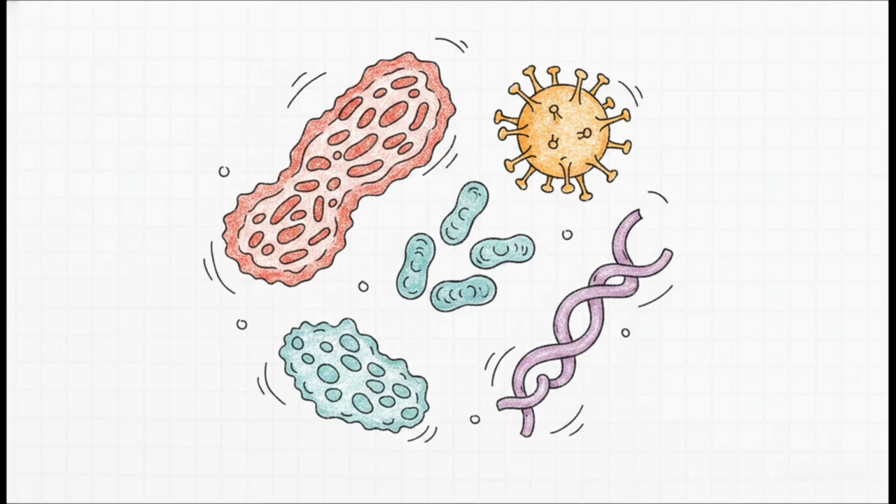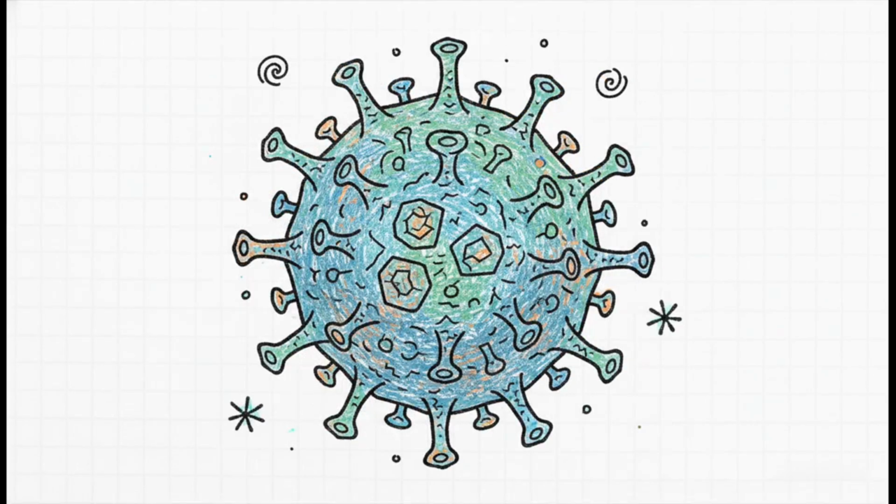Scientists can now view the detailed topographies of complex cellular structures. They can capture high-resolution imaging of microorganisms, we're talking bacteria, fungi, viruses, and observe them in their natural structural states. It's also perfect for analyzing the surface morphology and structure of delicate polymers and biomaterials. Being able to view these topographies without destroying the sample in the process, that opens up entirely new frontiers in medicine and chemistry.